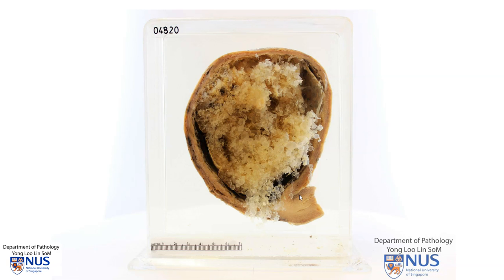Hello, this is a pathology specimen showing a uterus that has been bisected. We can see that this is the uterine fundus. We're looking mostly at the endometrial cavity, and this is the uterine wall. Over at this end, we can see the uterine cervix, which is partially truncated distally.